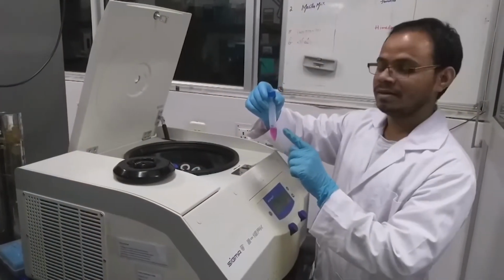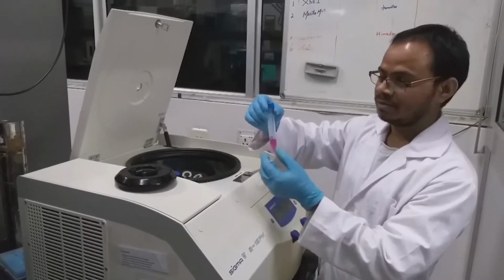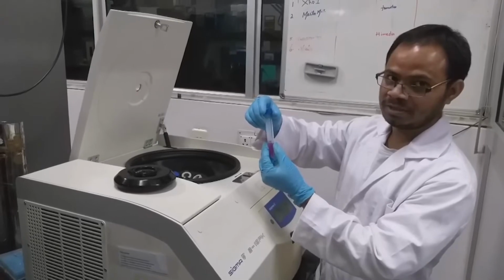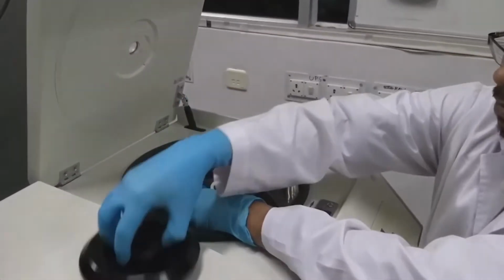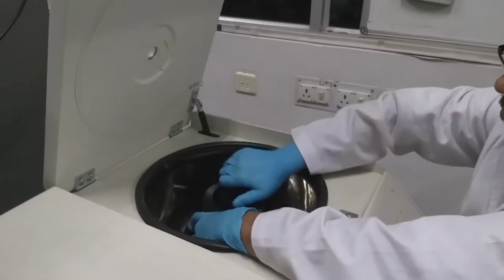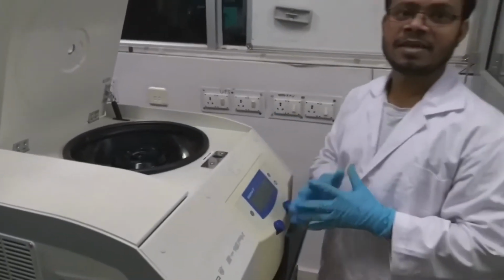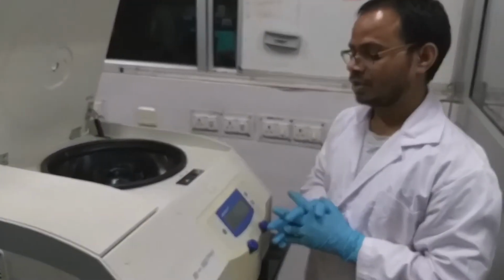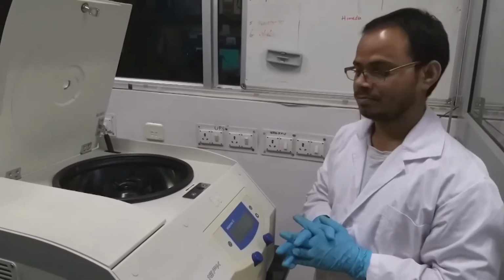After cells are detached, we have taken them into a clean Falcon tube. Then we have to centrifuge the cells. As these cells are very delicate, we have to centrifuge at 1500 rpm for 2 minutes.